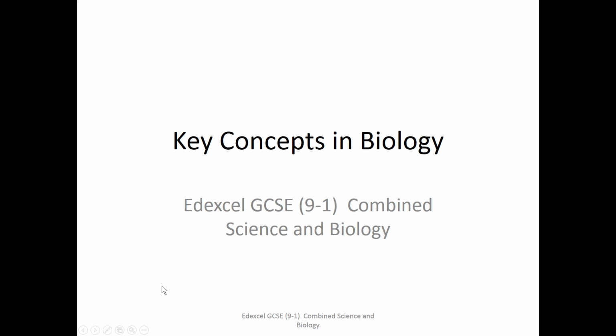Hello and welcome to a video about microscopes and calculations. This links to the Edexcel 9:1 GCSE Combined Science and Separate Science Biology specification. To begin with, I will be looking at the main parts of a light microscope and their functions.